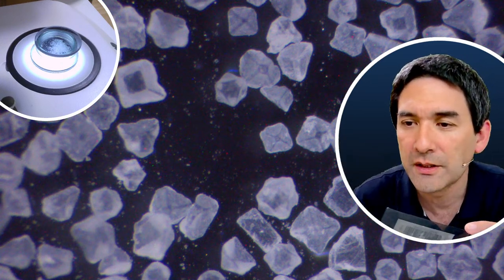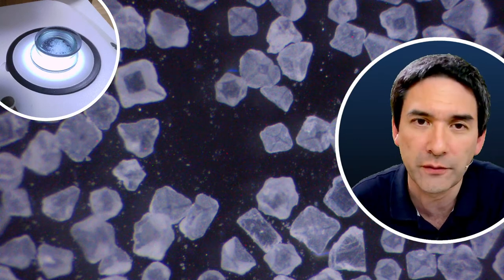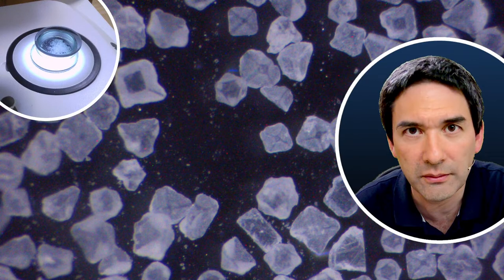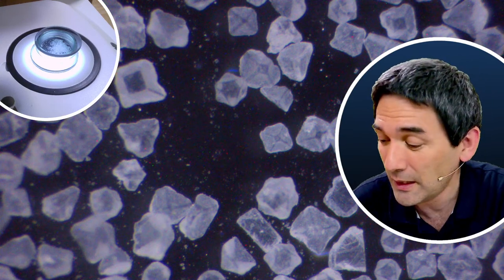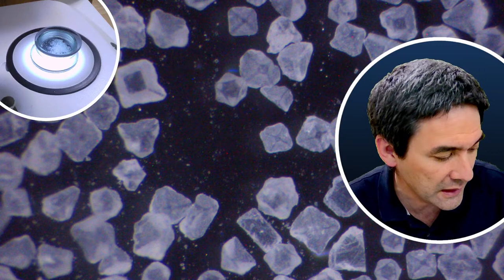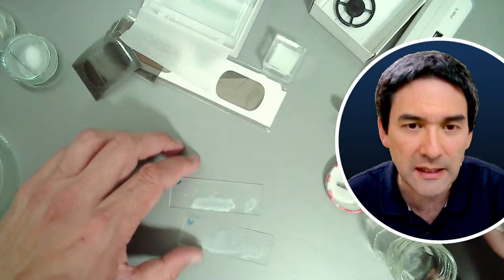So what I want to do now is the following. I would like to show you a couple of nice pictures of a couple of crystals that I've made, because these are specimens that are very suitable for polarized light microscopy, because they look very beautiful. I would like to show you how I've made those, and I've prepared some slides here. I'm going to switch over again to the desk view with vitamin C.